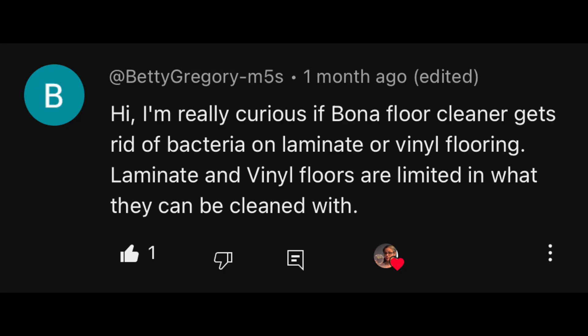Hi everybody. Today's focus, I am testing Bona disposable wet cleaning pads to see how well they remove bacteria from my floor. Today's video is a viewer request. I have had requests to test Bona from Betty Gregory, Brian W, AI13N1NV8D3R, and others.